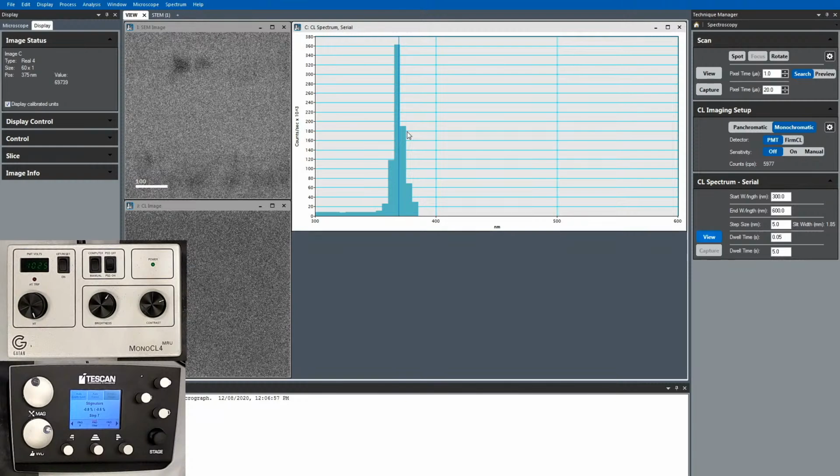So what I'm hoping to see is maybe another peak. This could just be fluorescence in the substrate from X-rays, from backscatters, etc. You've got such a small layer that your interaction volume will be going into your substrate. So maybe we'll see if there's another peak elsewhere.